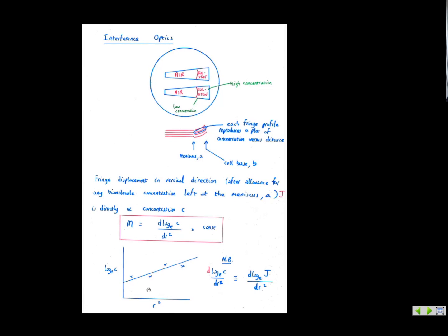And if you've got a heterogeneous polydispersed system, as you often get with large glycans, then this will be curved, and the average slope will give you the average molecular weight or molar mass, which will be a weight average molecular weight, as opposed to osmotic pressure, which you saw in the other module, BIOS 4074, which gives a number average molecular weight if you've got a heterogeneous or polydispersed system.